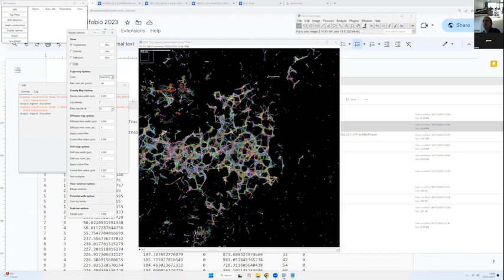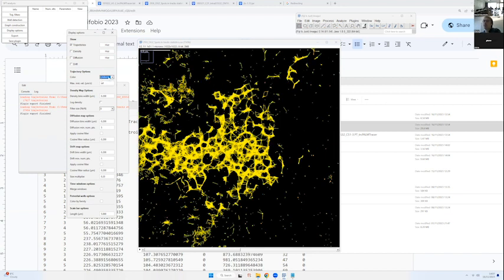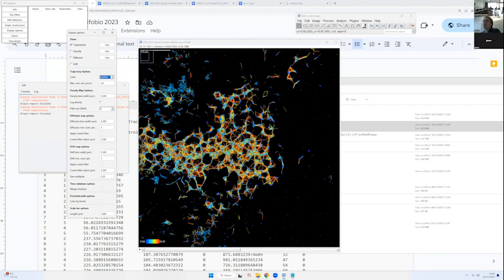So for the trajectory, we can choose the color. We can use uniform color code or based on instantaneous velocity, as David has shown you. We'll come back to it later. But by default, random color gives one color for each trajectory, randomly.